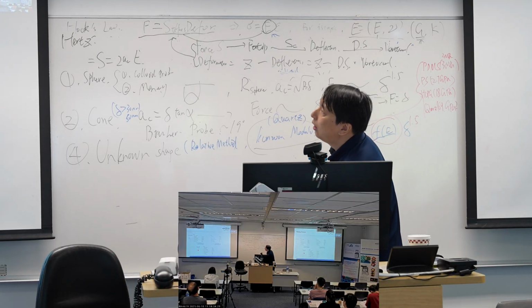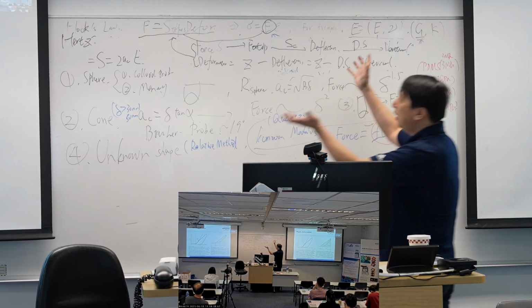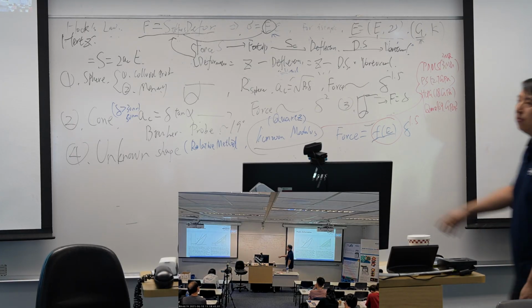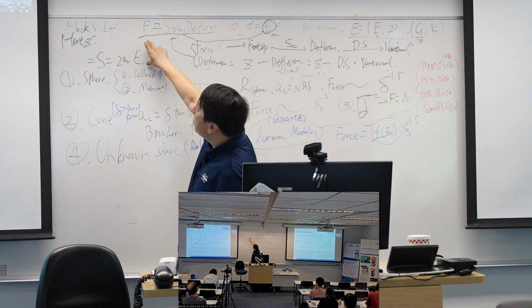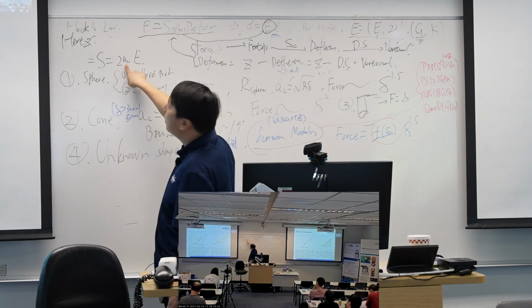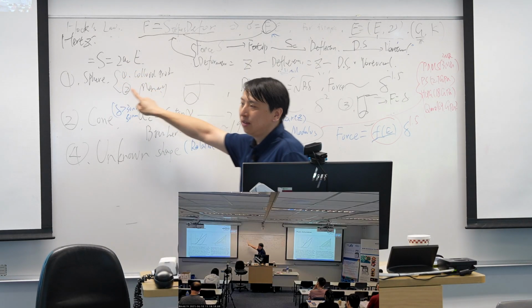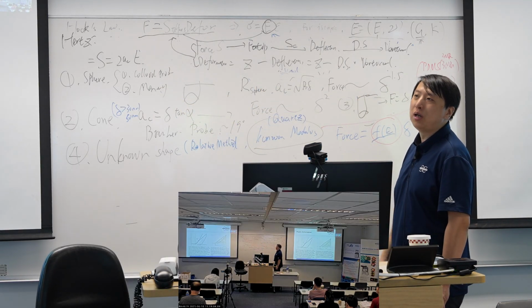I think that's all about the contact mechanics. Basically, we're starting from the Hertz model. We establish a relationship between stiffness and the modulus. The whole idea is we need to figure out the contact radius. For the contact radius, we can use the geometry of our probe.